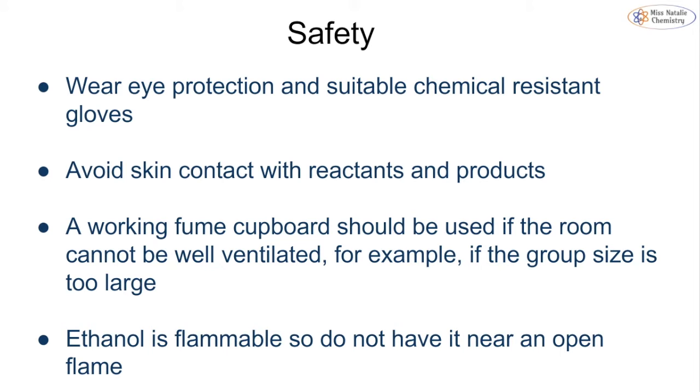So for safety, of course, wearing eye protection and also wearing gloves. Ethanol is flammable, so make sure it's not near an open flame, and ideally we should be using a fume cupboard for this if we can't ventilate the room properly.